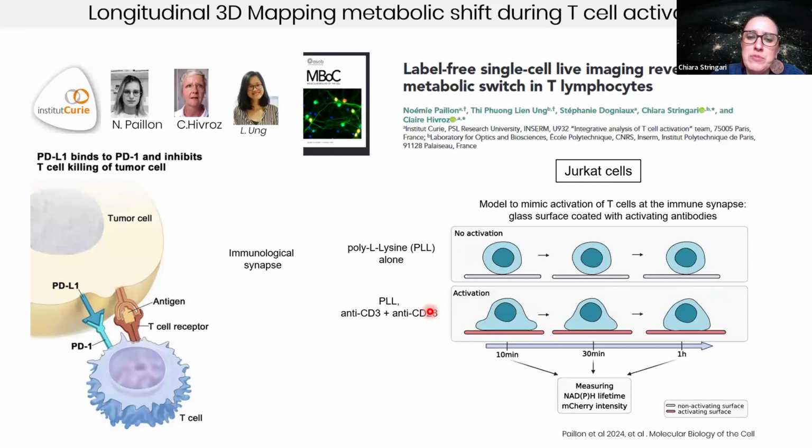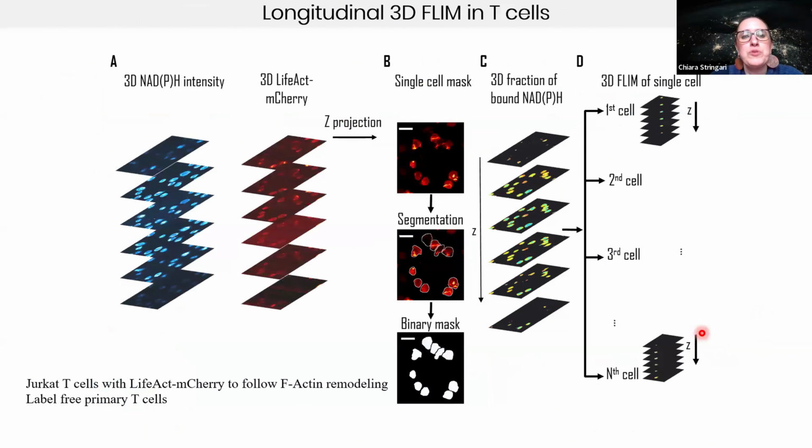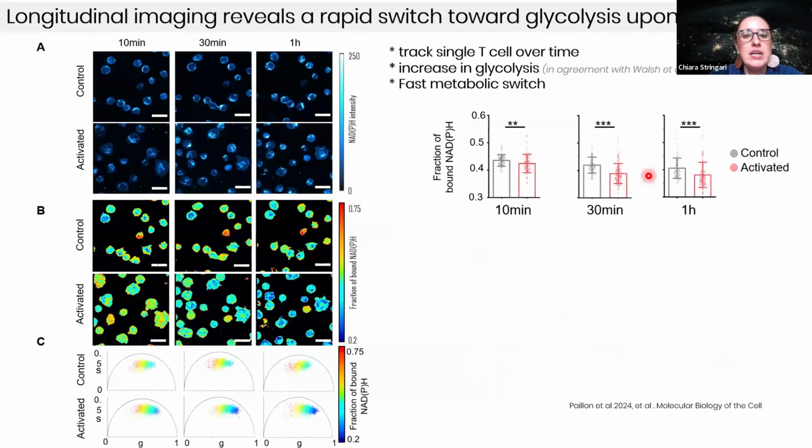We were simulating the immunological synapse by coating the coverslip with activating antibodies. We did longitudinal imaging in 3D and performed single cell segmentation in 3D.